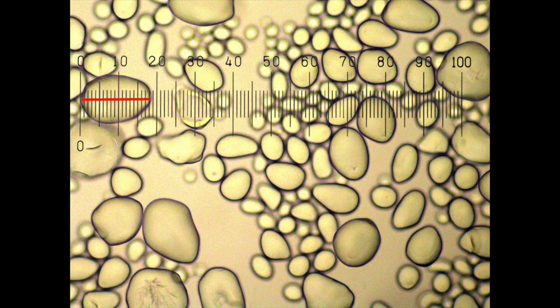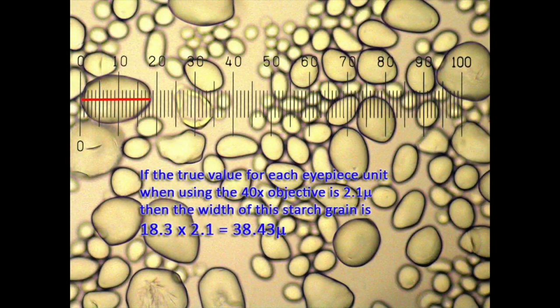If you apply the value we derived previously of 2.1 microns per IP unit for this objective, then this starch grain actually measures 38.43 microns in width. And that's all there is to it.